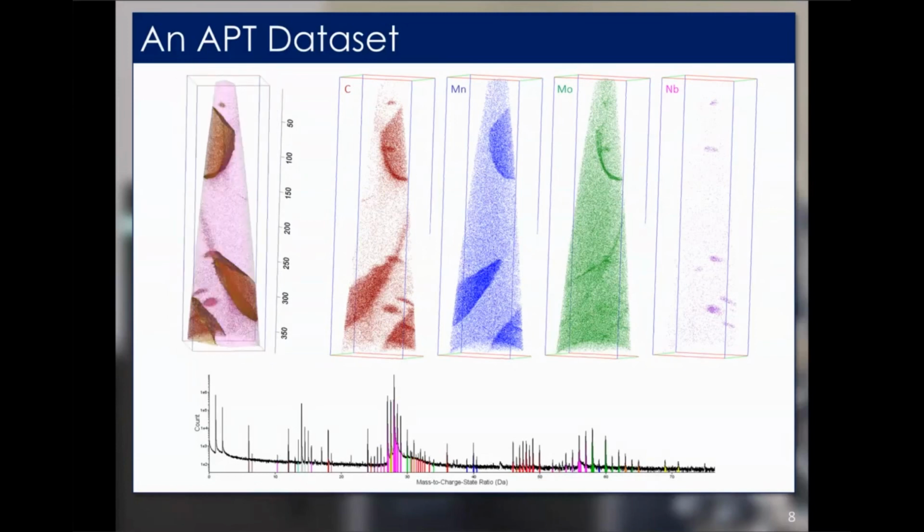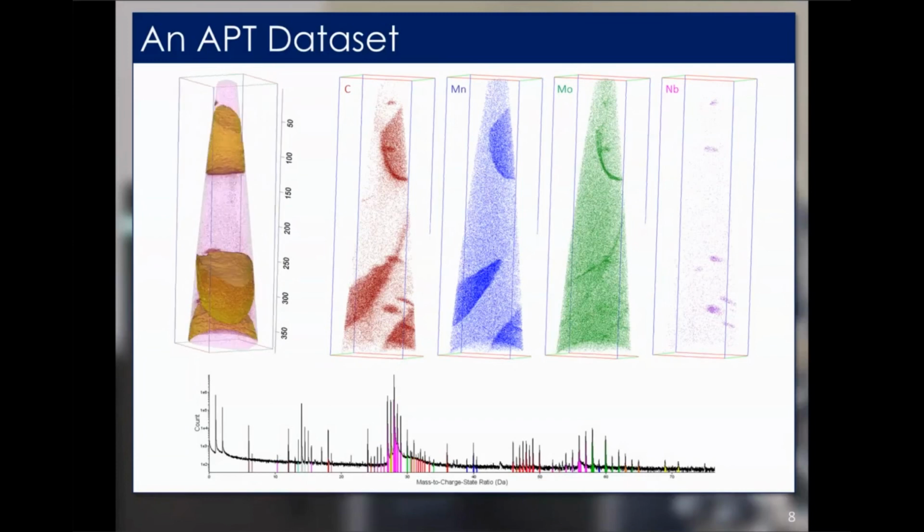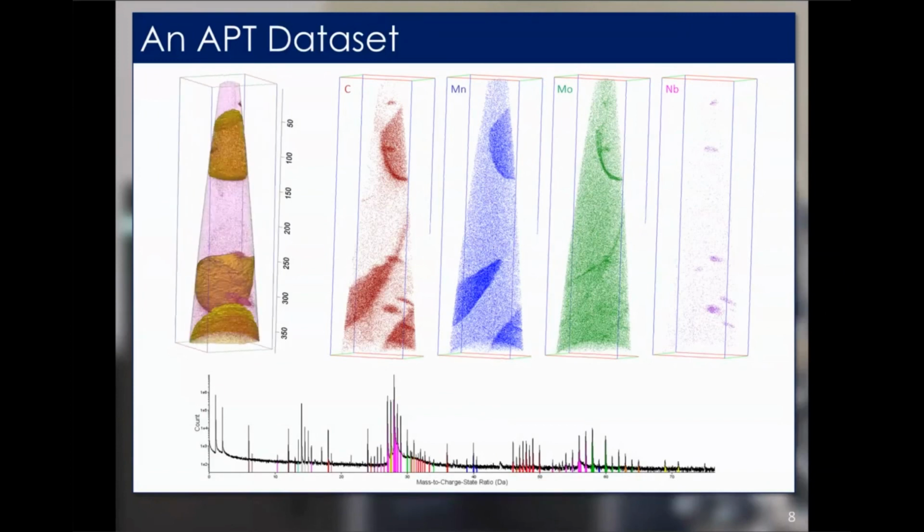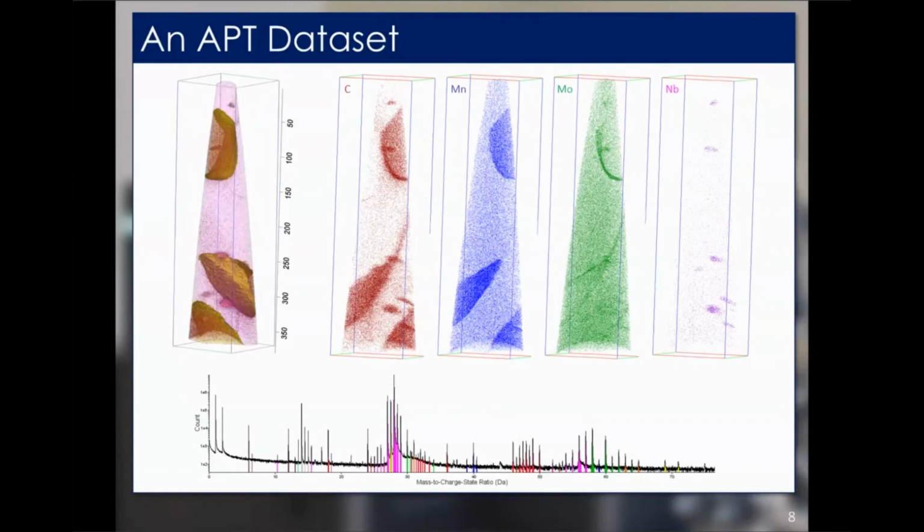And that's really where we get a lot of the information from Atom Probe, essentially looking at the arrangement of atoms, what they are and where they are. If they're segregated to any areas, if they are forming any features that we can see, and then we can measure the features and so on. And we can really go in depth with this.